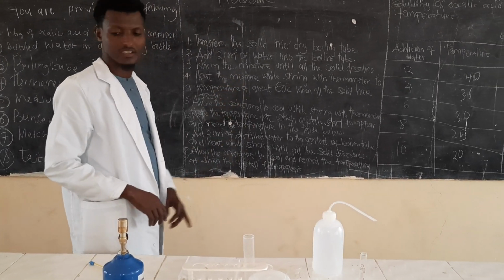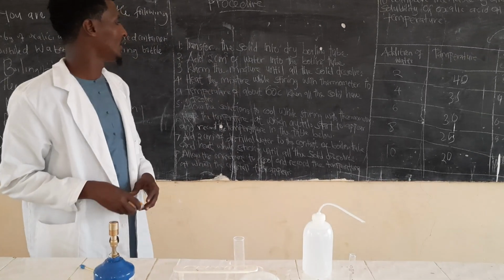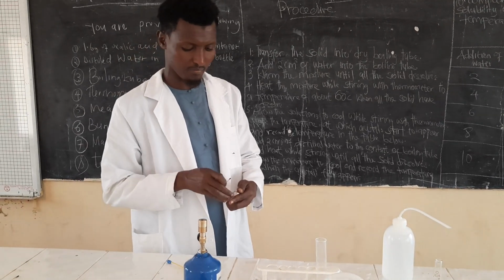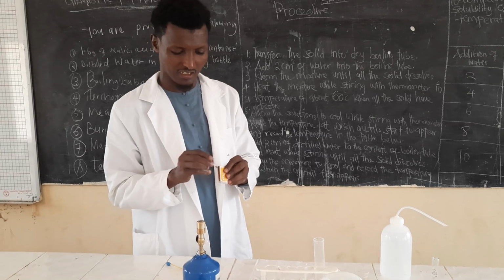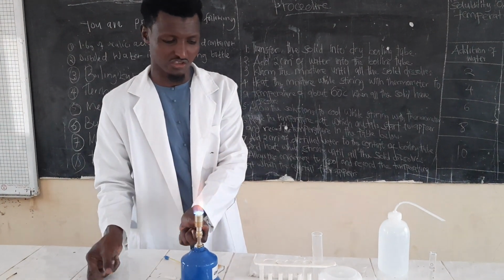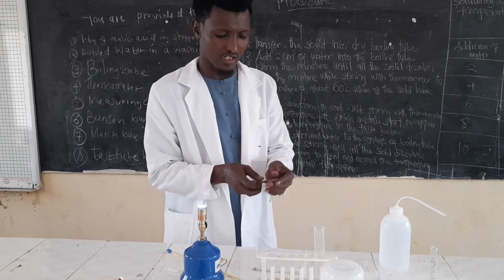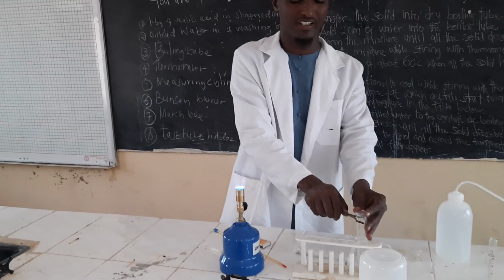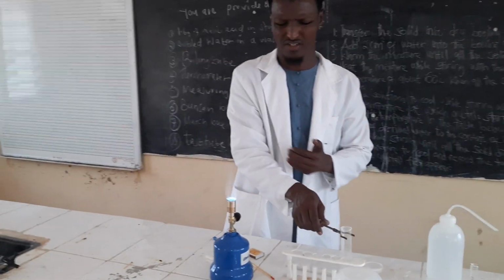Warm the mixture until all the solid dissolves. I'm going to warm the mixture in the boiling tube until all the solid dissolves.